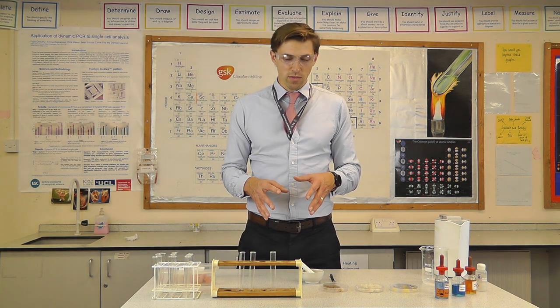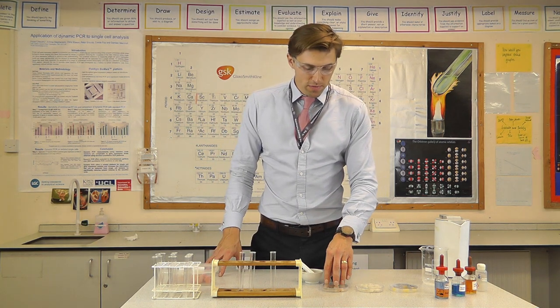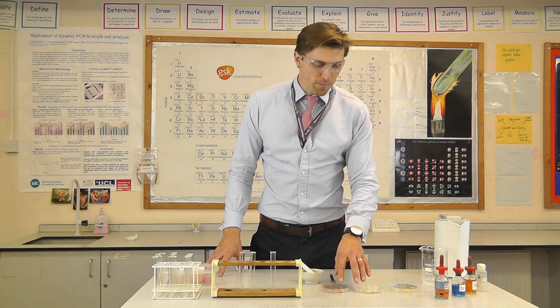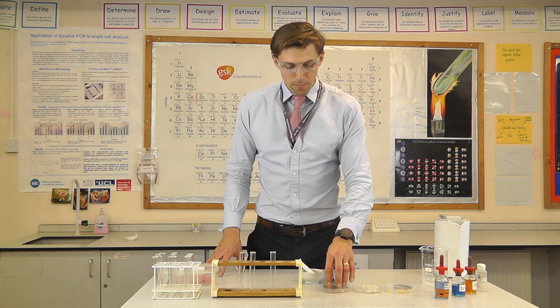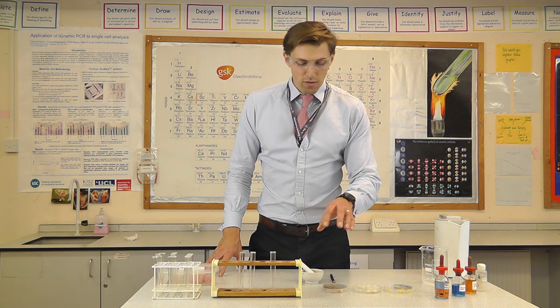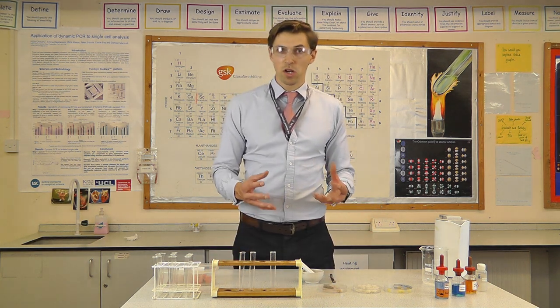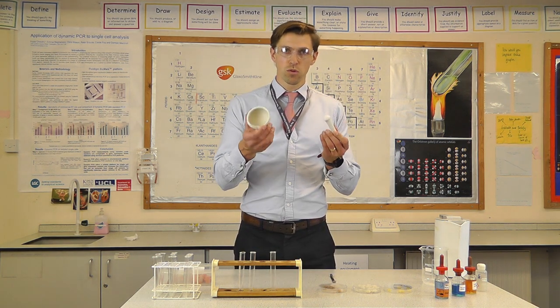To start with I'm going to prepare my samples. I've got three samples to show you today: biscuit, white bread, and some cheese. I'm going to start with the biscuit first. The first thing I have to do is crush it up in a pestle and mortar — the mortar is the bowl.